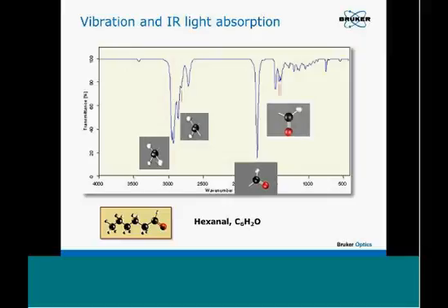The bands around 2800 are related to CH stretching vibrations. Basically, each individual band can be related to a specific vibration or to the skeleton vibration of the whole molecule. The idea is that if you get a spectrum of a molecule, you can easily link it to the chemical structure of the molecule.